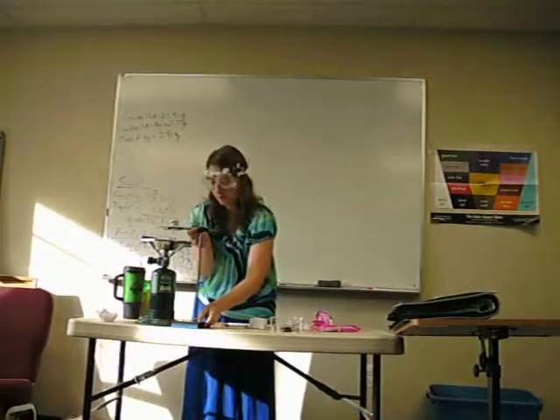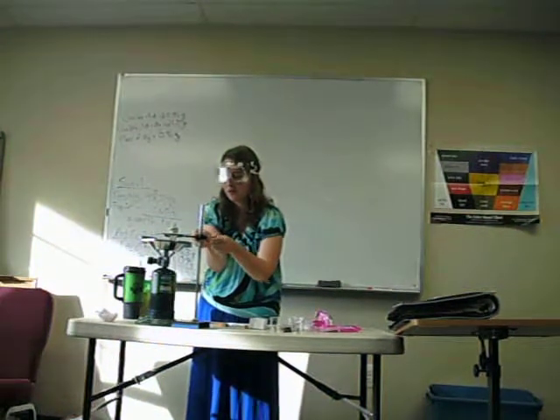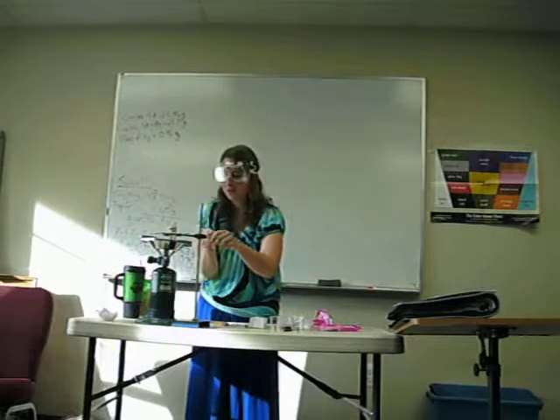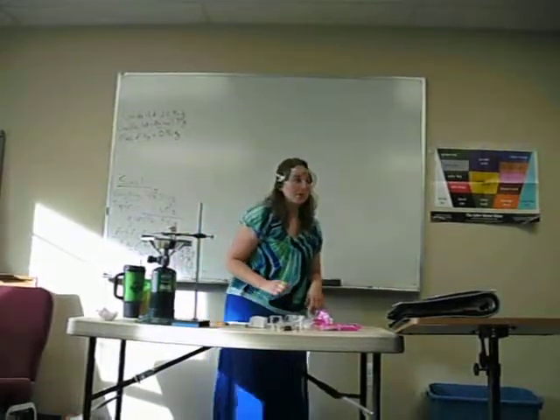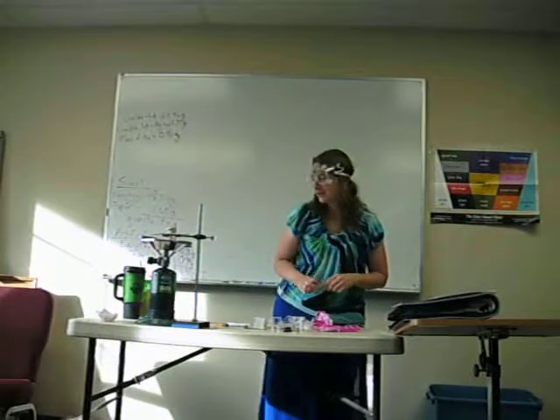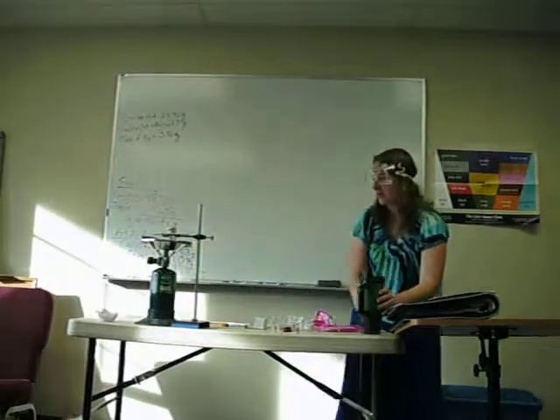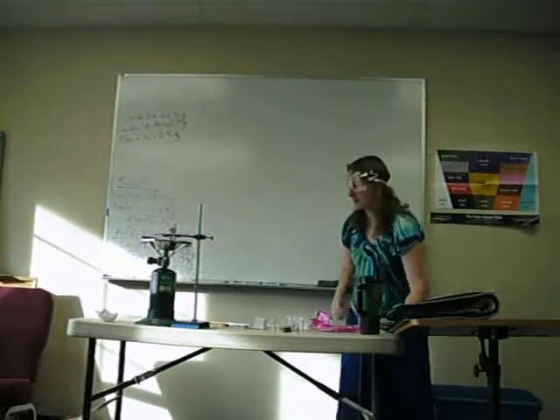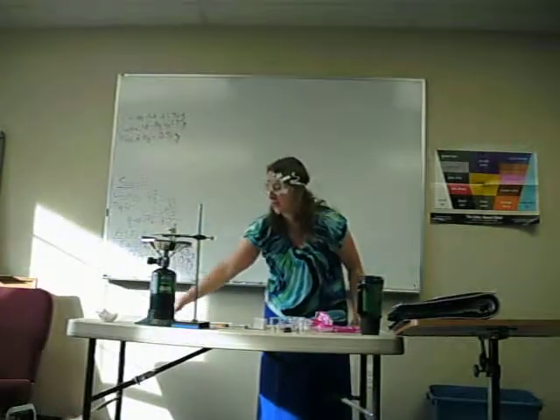Do we need to mention like a triangle and everything, or just the crucible? The crucible is heated, it'll do fine. But just so you guys know what the thing is called, we've got a crucible and a triangle. So, anyone read The Crucible ever, the book? Oh, yeah. This will quickly demonstrate exactly what a crucible is, because it'll glow blazing red hot.